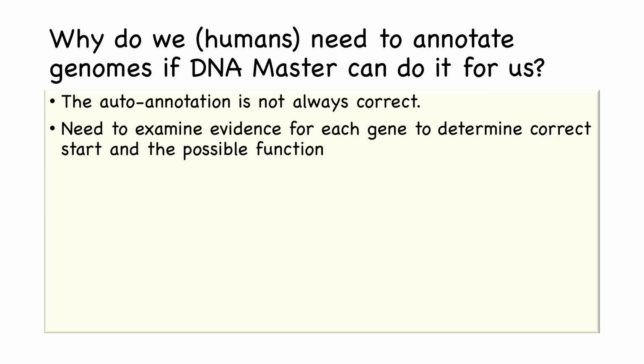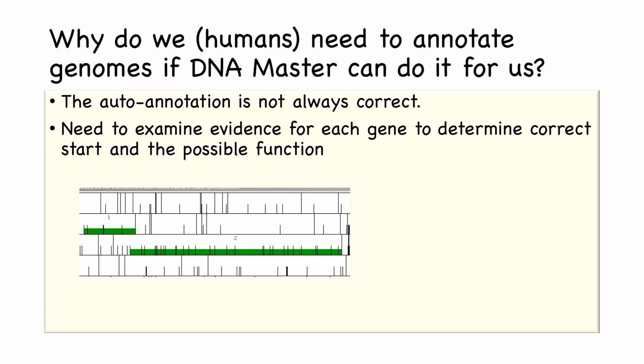And finally, these programs cannot predict the function of the genes, and so we have to look at multiple pieces of information to determine whether we can predict a reasonable function or likely function for each gene.